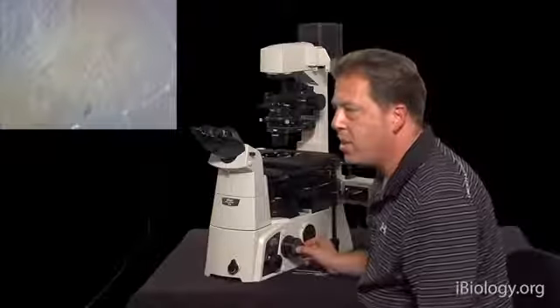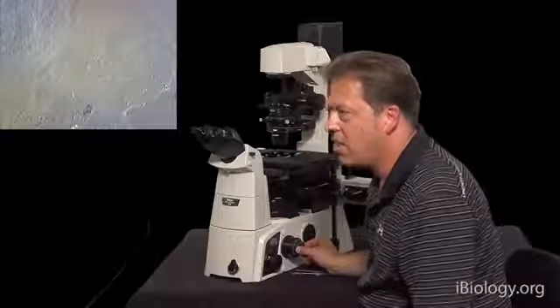So now you can see these cells in DIC on the camera, and you can see the nucleus, and you can see sort of a three-dimensionality. If you're at extinction, you really don't get much of an image, but what you need to do is move the polarizer slightly off extinction, and now you can see on the camera that you get this nice three-dimensional look of the cells. Okay, just touching up the focus there.